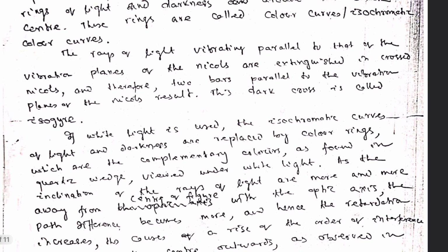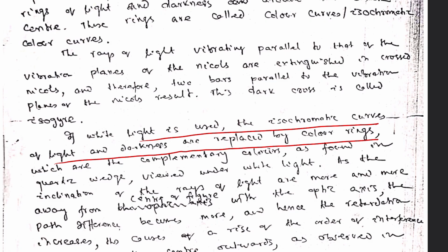If white light is used, the isochromatic curves of light and darkness are replaced by colored rings, which are the complementary colors as found in the quartz wedge or in Newton's scale of interference colors viewed under white light.